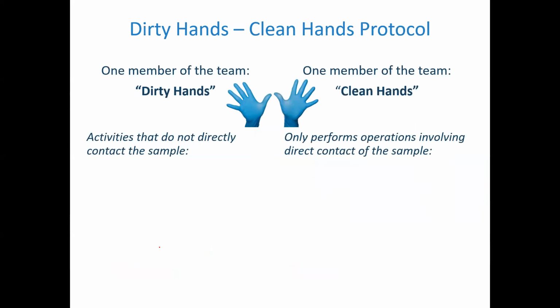So one protocol that I really would like you to know lots about is this protocol here called dirty hands, clean hands. Okay, so this is the kind of thing that you could get asked at a job interview. It's actually a pretty common job interview question for the employer to ask people who are doing field sampling. They will say, do you know how to do dirty hands, clean hands?